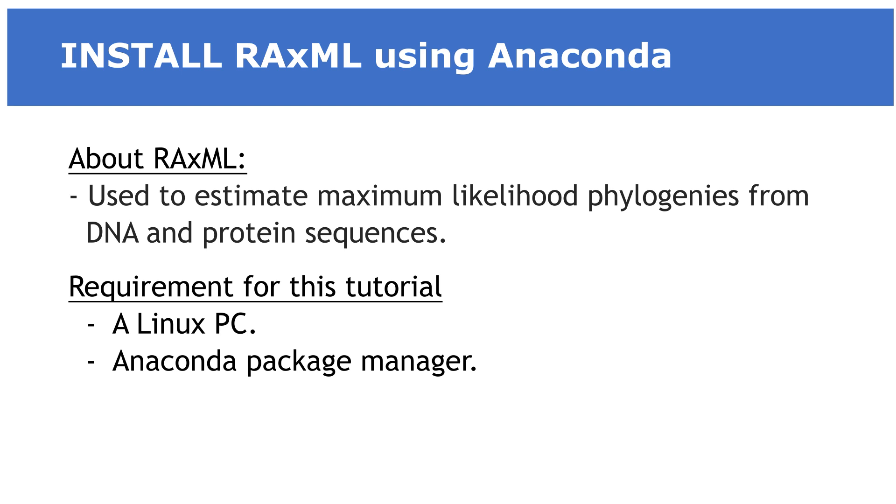In today's video, I am going to show you how you can use Anaconda to install RAxML in a Linux environment. RAxML is a tool that is used to estimate maximum likelihood phylogenies from DNA and protein sequences. You can run it in different operating systems but our focus today is on Linux.